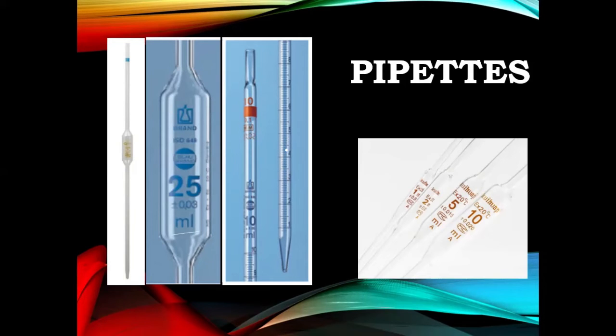If you are using a pipette filler or just simply using your finger, then you can stop at any volume when you are transferring, or you can siphon any volume through it. Siphoning means to move a liquid upward and to drain it again. So you can take any volume here and you can transfer. So this is more reliable and usable as compared to this.